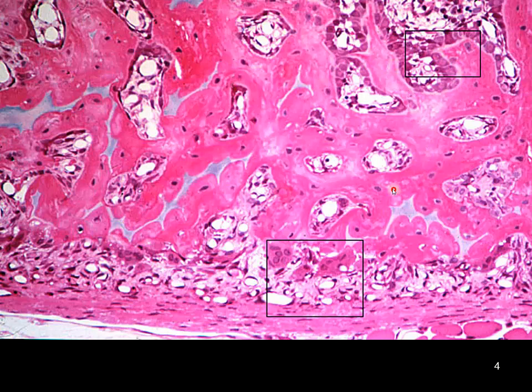Now, nuclei that are completely surrounded by the bone matrix, these are our osteocytes. And then we have other cells that we can see associated with bone that are multinucleated and extremely large. These are going to be our osteoclasts. These are our bone resorptive cells, and we're going to look at these in a little bit higher magnification as we go through.